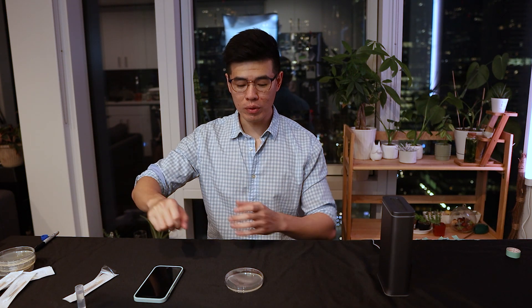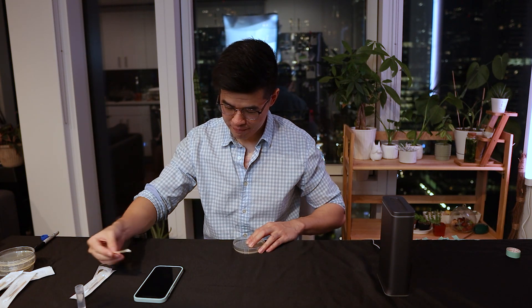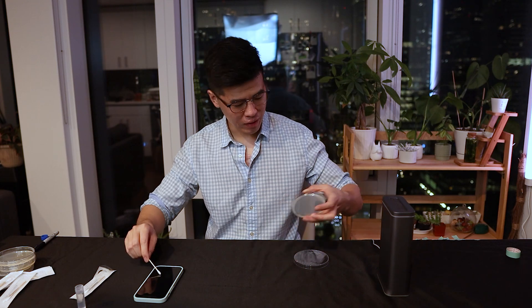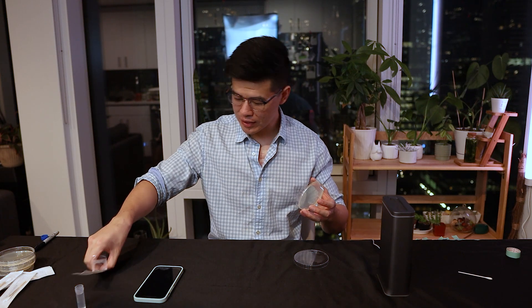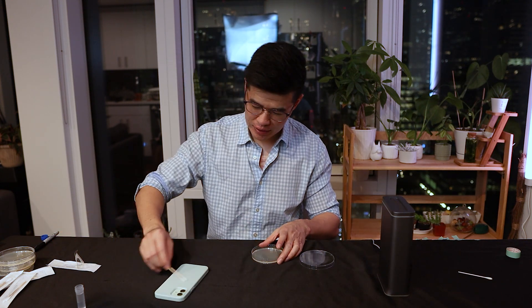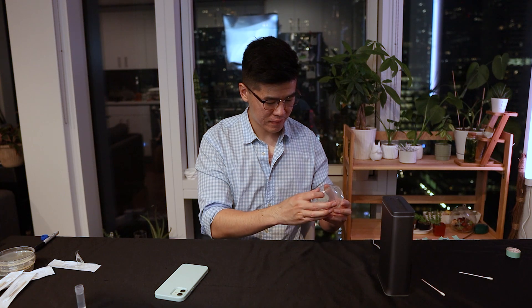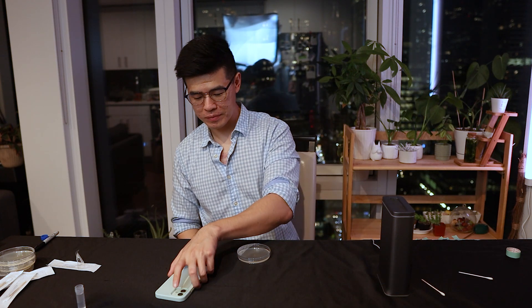Alright, just got back from the gym. This is my dirty phone. The way this is going to work — I'm going to swab the front of the phone, and that's going to be the top half of the petri dish. Then I'm going to swab the back of my phone, and that's going to be the bottom half. Get a little bit of water and get all of that front. Then I'll take a clean cotton swab, dip it in water, turn the phone around, and get the back. Now I'm going to toss the phone into the Simple Human and I'll be right back.